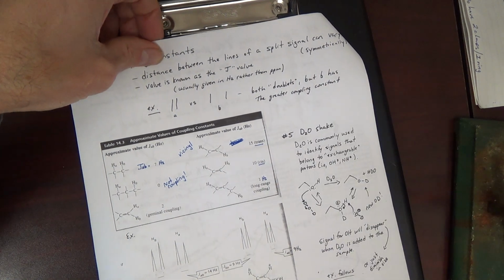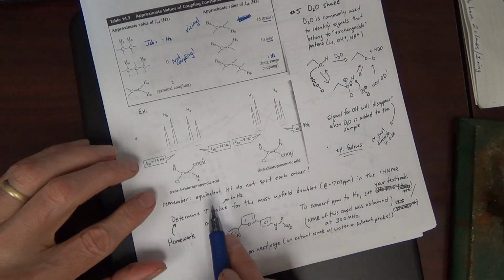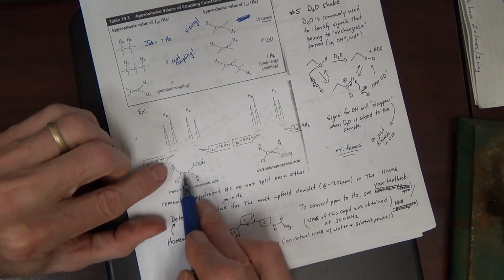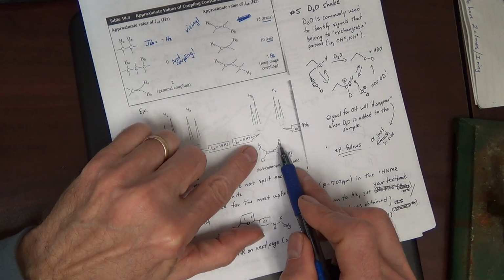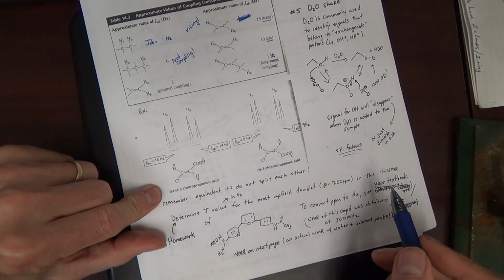Now, how can we use that information? If we had 2 compounds like these 2 here, these 2 carboxylic acids with the alkene, here the groups are trans, and thus the H's are trans. Here the groups are cis, and thus the H's are cis. You would be able to distinguish these two compounds by NMR.